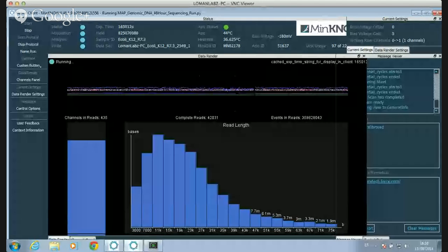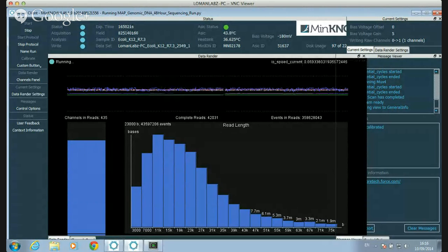I just wanted to check in on this nanopore run that I promised I would release, the R7.3 data. If you're interested in seeing what nanopore looks like, this is what the MinKNOW client looks like when it's actually sequencing. And if you're really sad, you can watch the first 2 hours of the MinION run, which I streamed when we put this on Google Hangouts the other day.